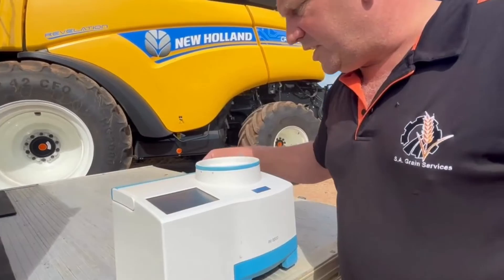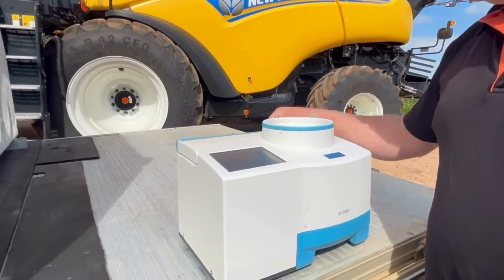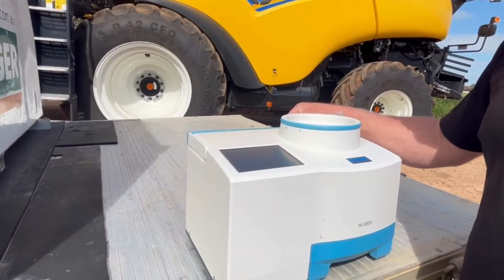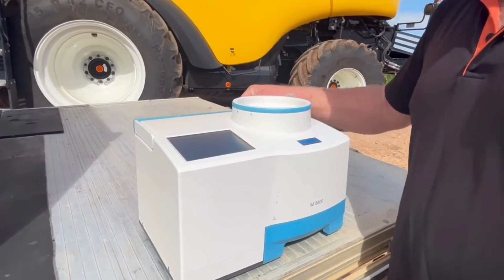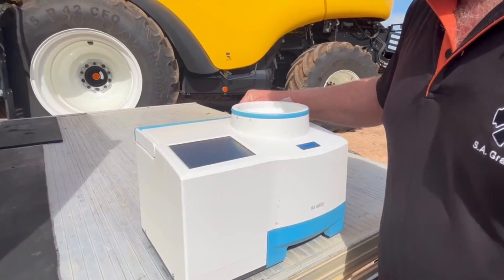We've just done 10 and it's self-cleaning — hopefully. Yep, there you go. Then we'll just wait 30 seconds and it'll come up with the answer.